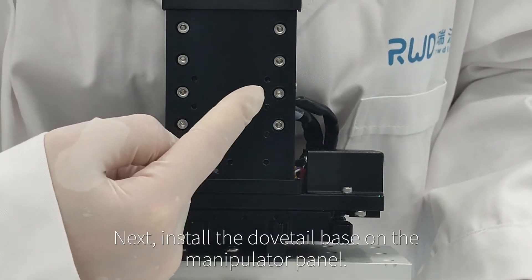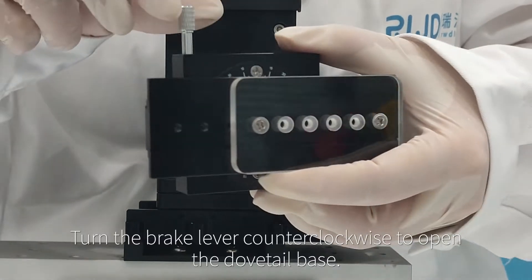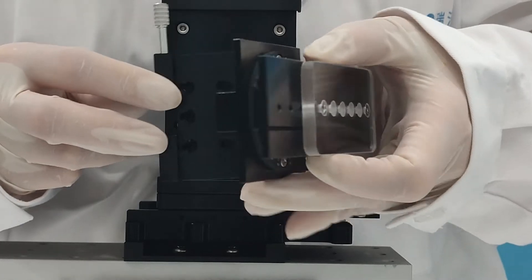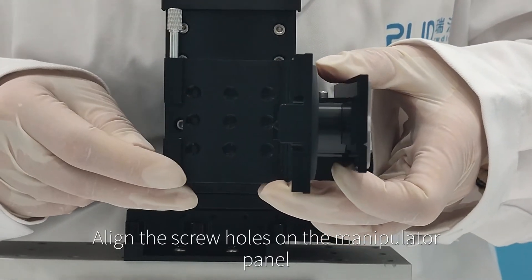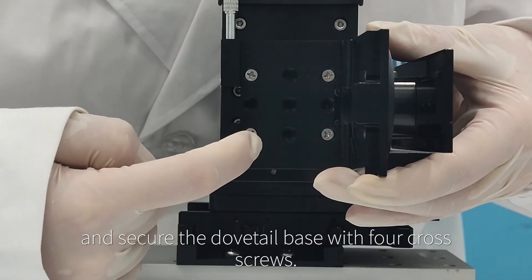Next, install the dovetail base on the manipulator panel. Turn the brake lever counterclockwise to open the dovetail base, align the screw holes on the manipulator panel, and secure the dovetail base with four cross screws.